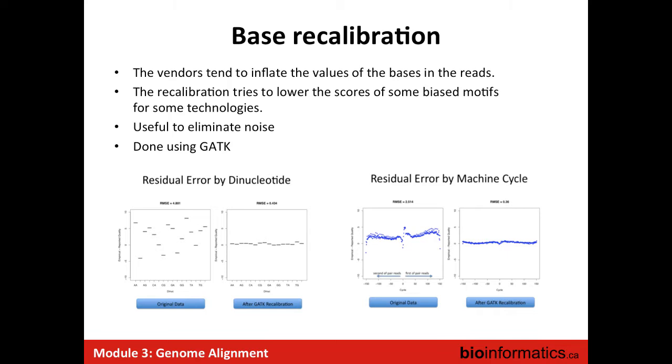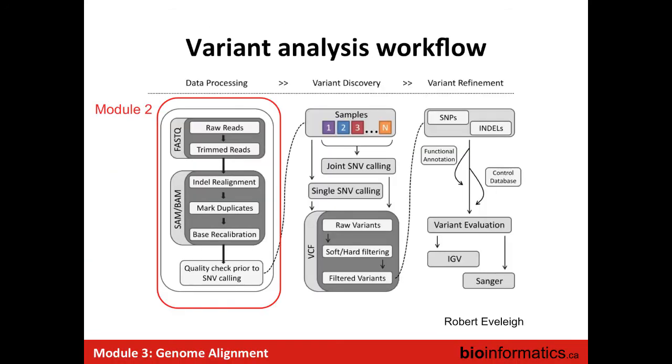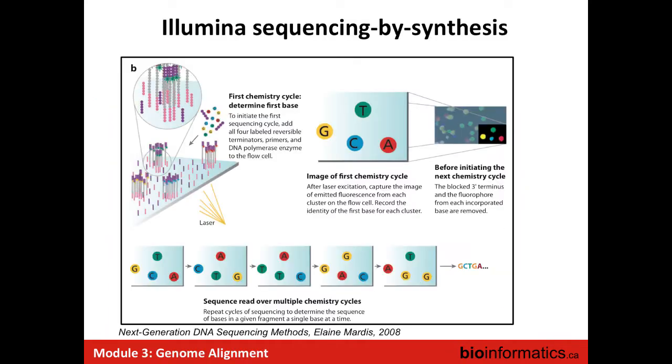Can I ask a really basic question? It's about doing the sequencing. I'm a bit confused in my head. So you put the template on the flow cell, and then you amplify. And then it looks like you're sequencing in one direction, or is it both directions? What do you mean by one direction? So we talked about there being a forward and reverse read. But if you've got this cluster, are you just getting a unidirectional read, or at this stage do you get the bidirectional? So you've got one read in one strand.